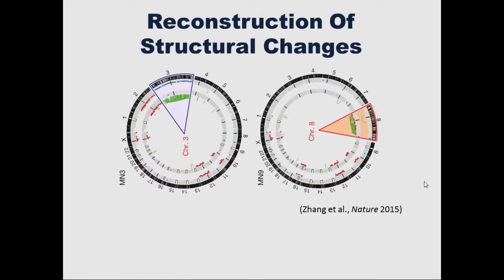Secondly, the sort of questions that as a biologist you would like to know of your extra pieces or pieces that you lost in your chromosomes are what are structural changes. So there is this paper from Zhang et al. that looked at chromothripsis, which is a sort of new idea on how chromosomes can evolve, and it's been linked to a lot of cancers, in which you have a single chromosome that's highly rearranged, represented by these lines here.